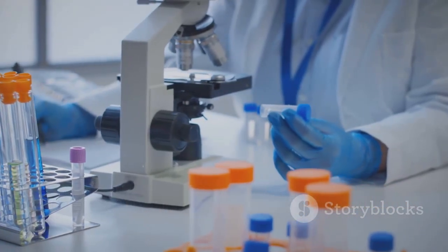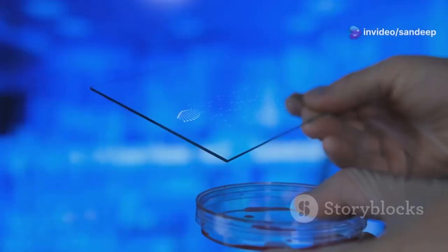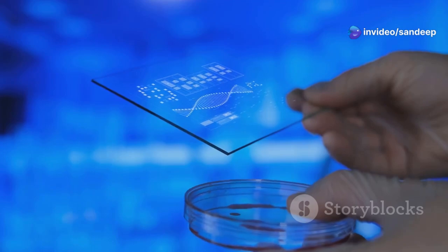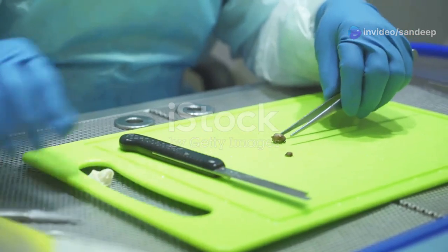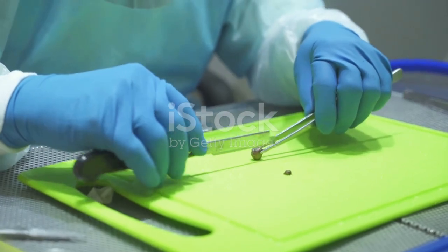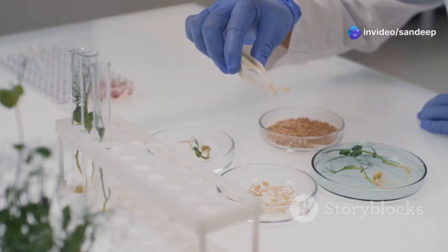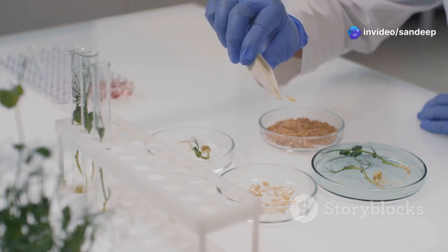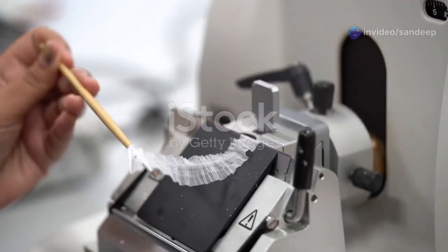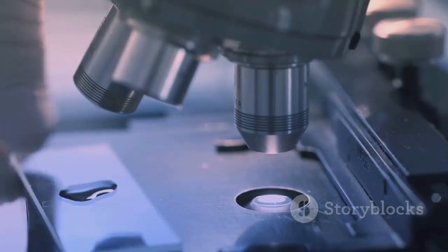The process of preparing histological samples for examination is a meticulous one, involving a series of steps designed to preserve the tissue's structure and highlight important details. The journey begins with the collection of a tissue sample, which can be obtained through a biopsy or during surgery. The sample is then immediately placed in a fixative solution, which acts like a biological pause button, halting any further degradation of the tissue.